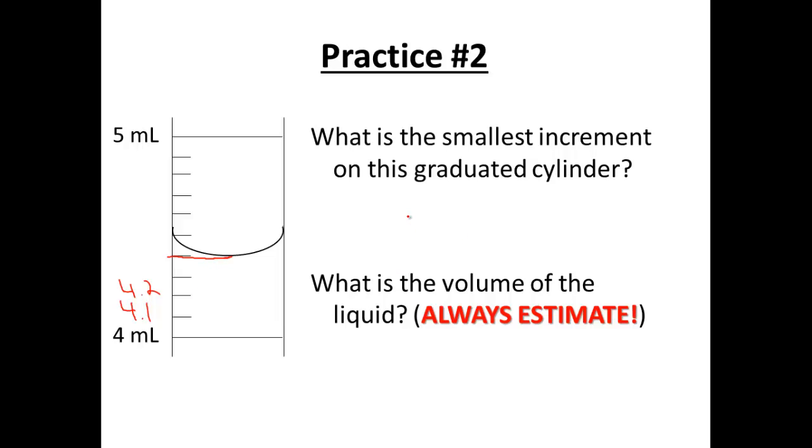The smallest graduation marks on this one were 1/10 of a milliliter. So we have about 4.4, and then we estimate that one extra spot, maybe about 4.41 milliliters, since it's just above that 4.4 mark.